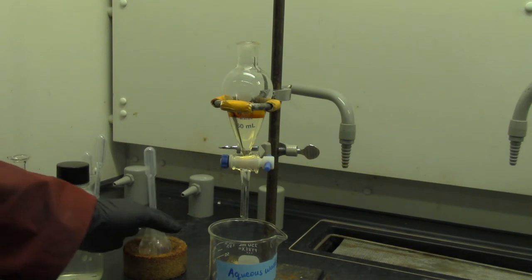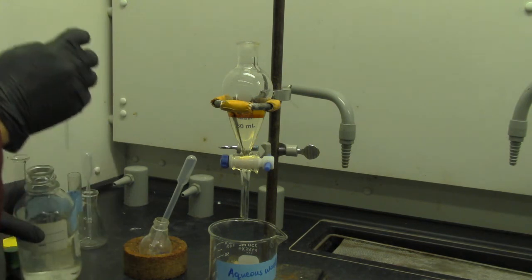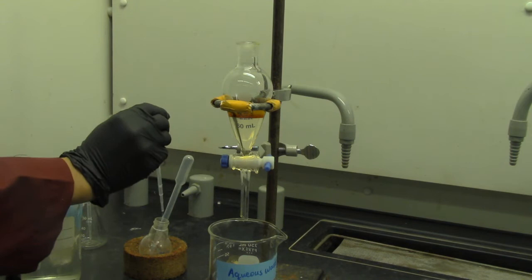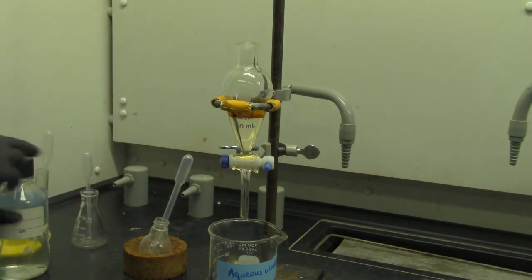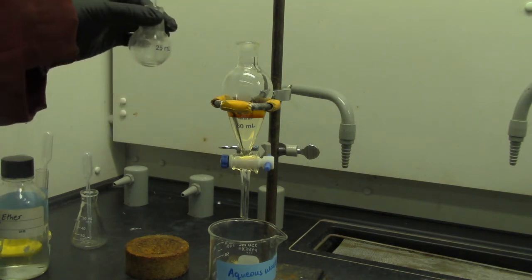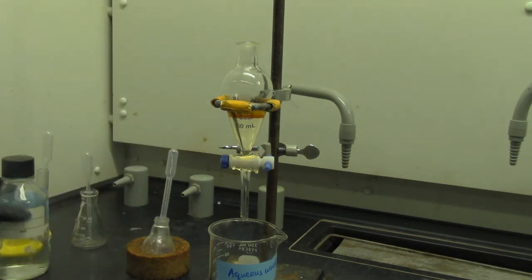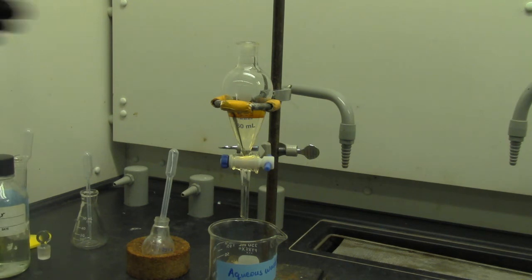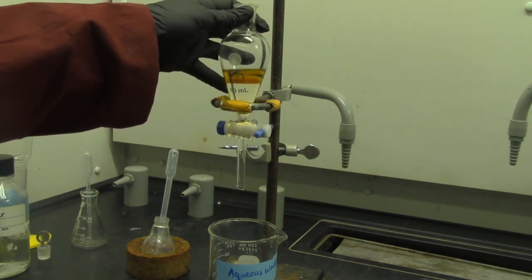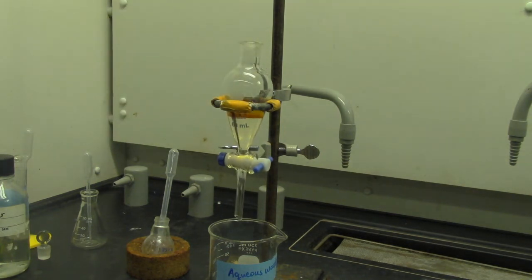So I'm going to rinse this round bottom flask with a little bit more ether. Okay, so ether, just a few mL. Good enough. So you can see two distinct layers, right? So if I lift this one up, you can see the top layer here, that's ether, and the bottom layer is aqueous layer, right? So what's in the top layer and what is in the bottom layer? So you can think about that one.